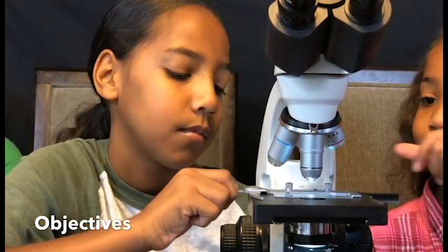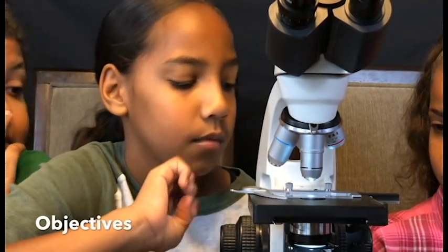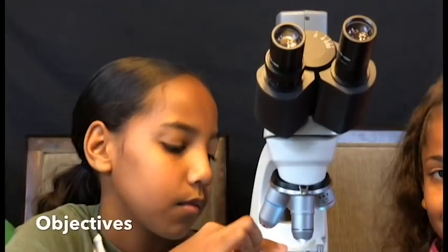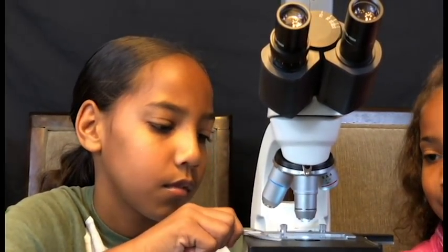That's a lot. So if you want to look at bacteria, that is the one you use. When we look at things, we look at total magnification — so it's the ocular times the objective. So it can be super powerful.